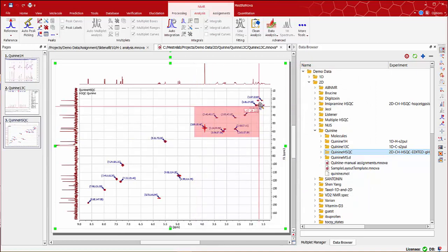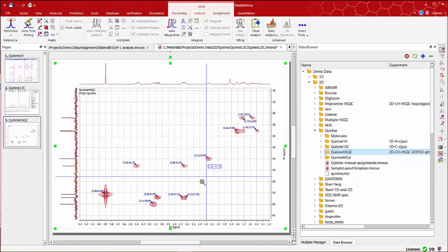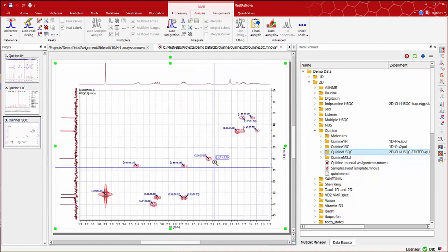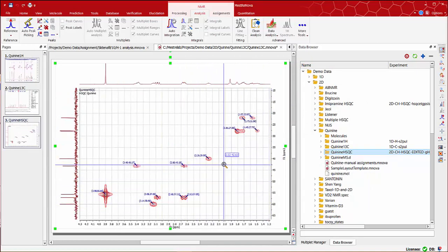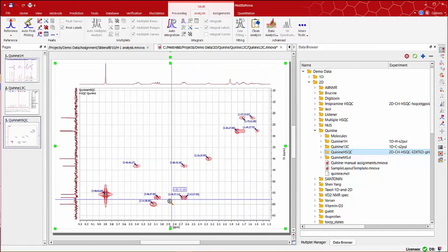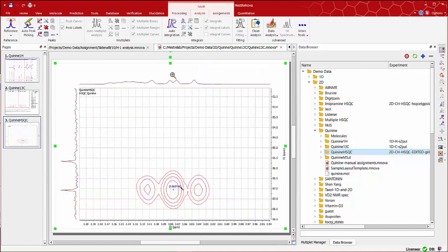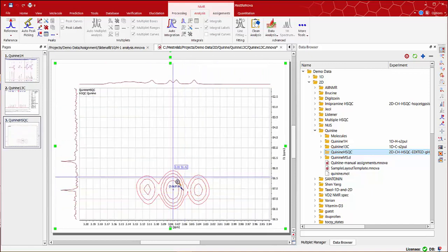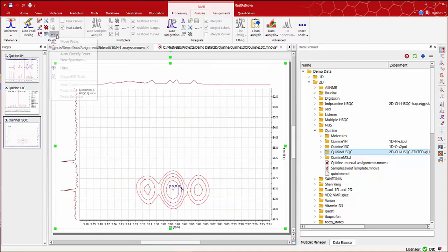Now, let's zoom in on this particular region, and we can see how for this peak, the center is not quite right. So we can use the MNOVA peaks tool to shift it to the center.